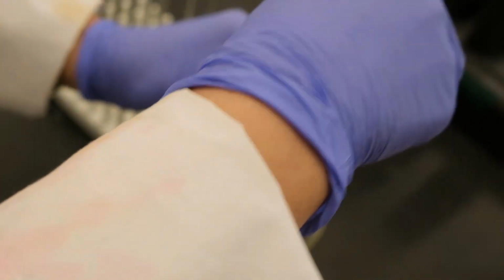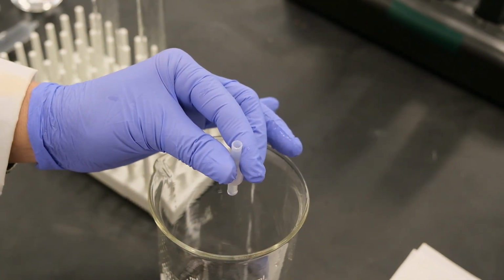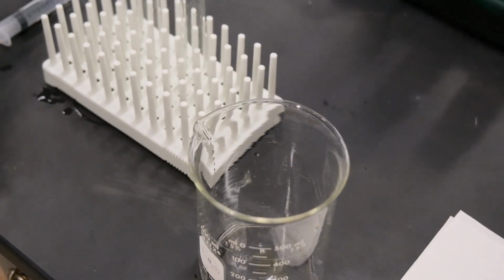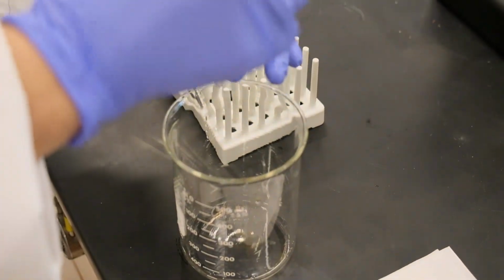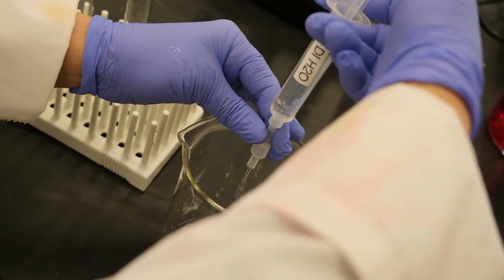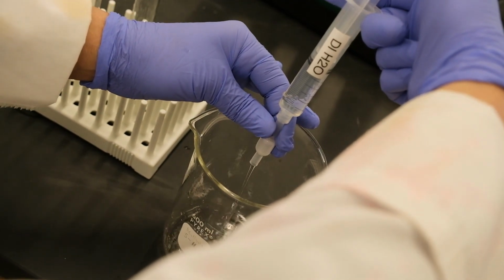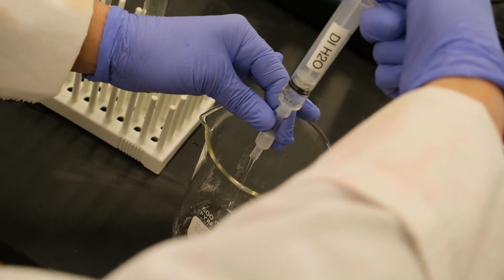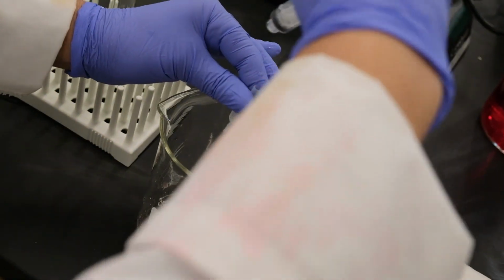Once we're done with that, we rinse our cartridge with deionized water. The first step is to make sure that our cartridge is really clean. So we push the deionized water through to make sure that no isopropyl alcohol is left over.